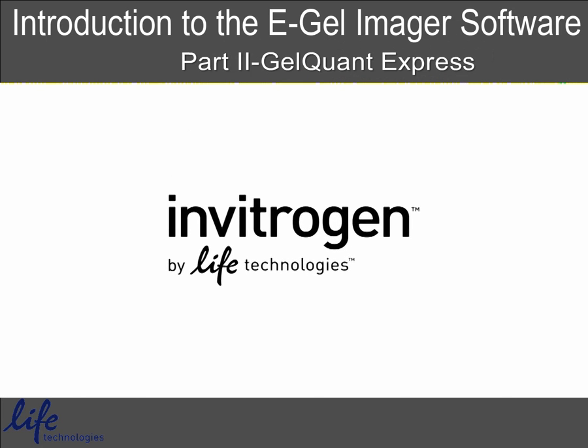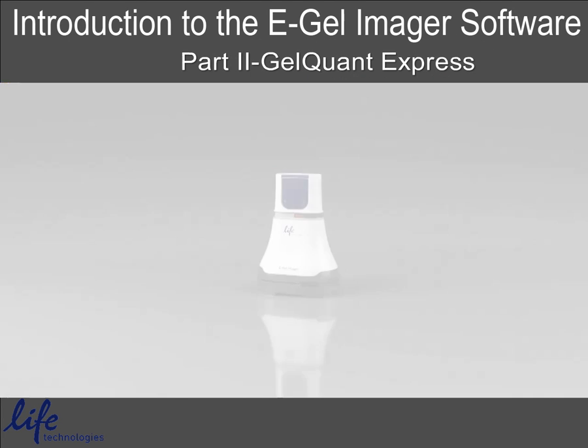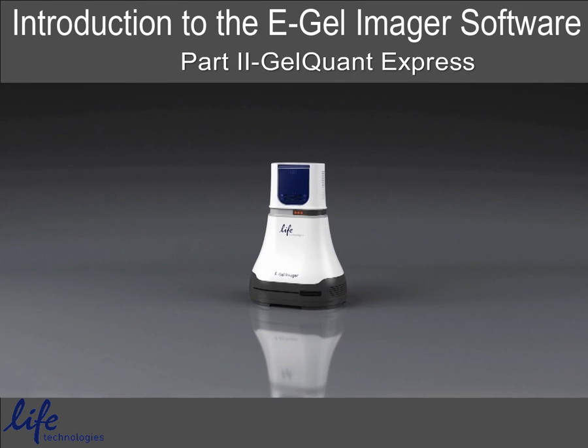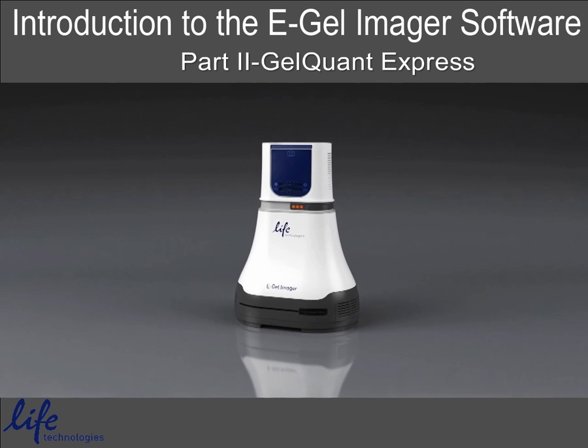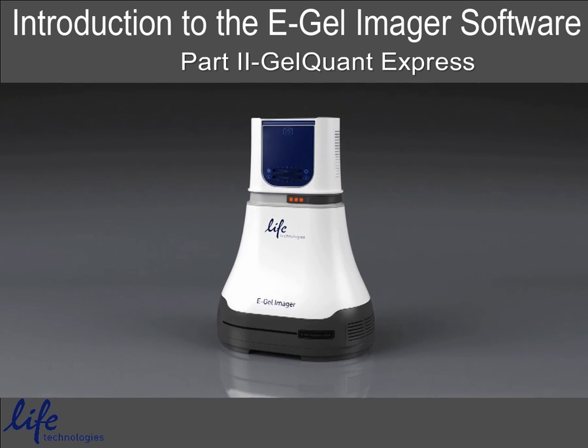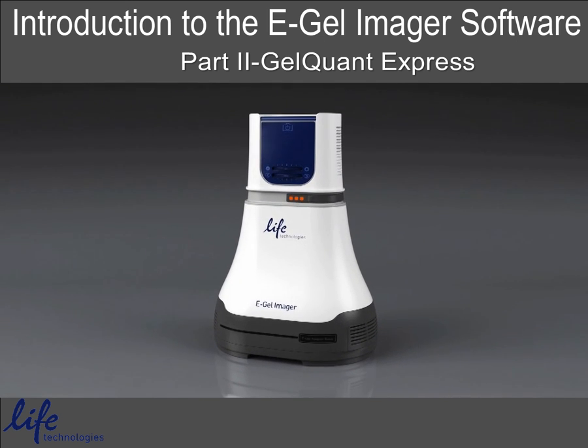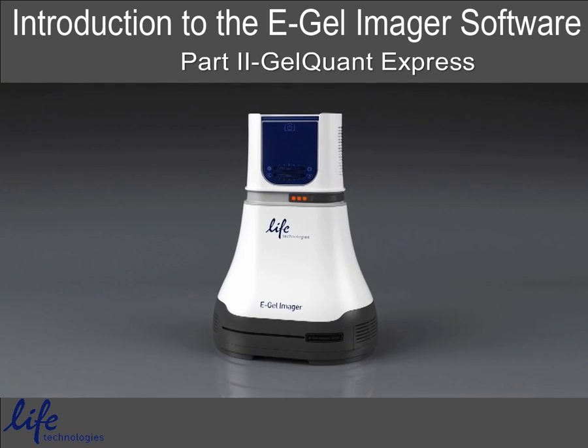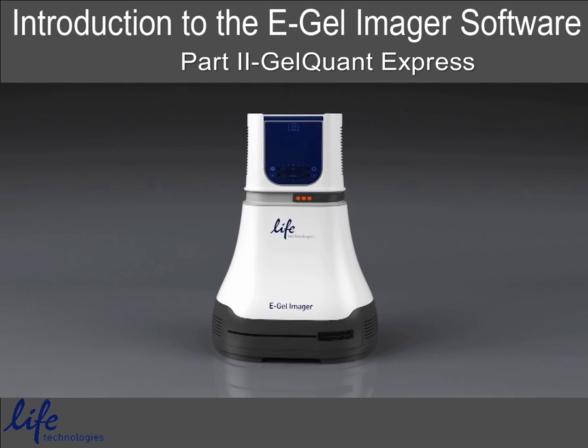Life Technologies is revolutionizing precast electrophoresis again. This video will present the GelQuant Express analysis tools.